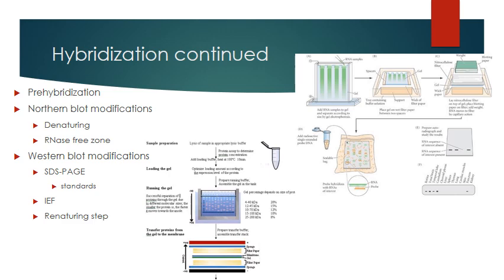They usually use polyacrylamide gels for proteins, which allows you to separate the proteins according to molecular weight. You can also use IEF gels, or isoelectric focusing gels, which separate them according to charge. Either one works very well. But remember, when you run a Western blot, you have to run pre-stained molecular weight standards with the samples, which allow you to control for your charge and make sure you actually separated everything.